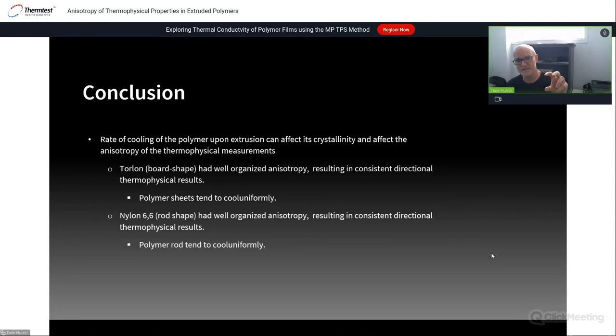And that measures resistance across a very specific controlled one-dimensional shape. So it's a very high confidence value, and you get a really high confidence in one direction. So certainly for anisotropy, you can cut samples or print them, or whatever is creating an anisotropy in your sample. You can certainly align those to the direction and measure those directions.